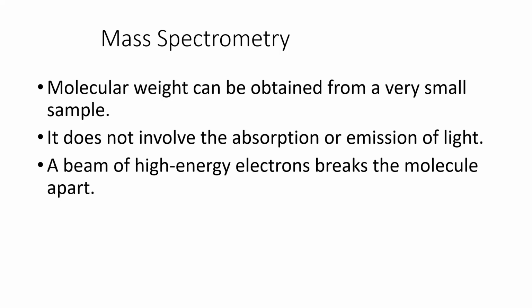We know that organic compounds are majorly held together by covalent bonds. So these bonds can be broken when high energy electrons are focused on such molecules.